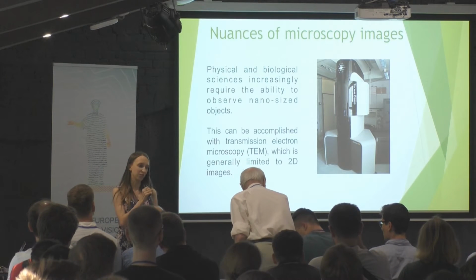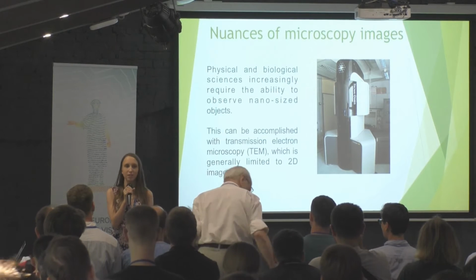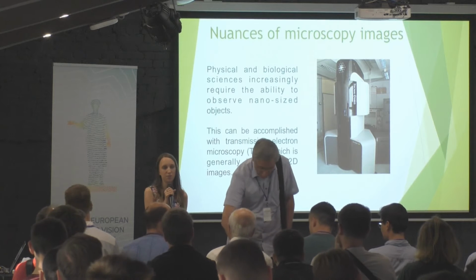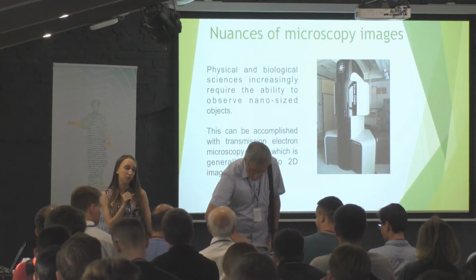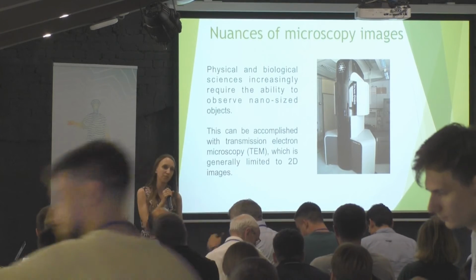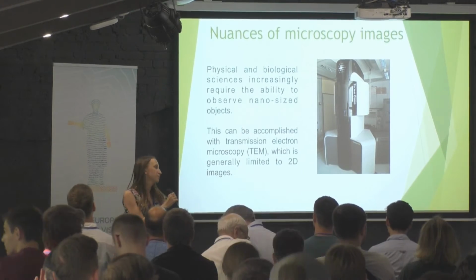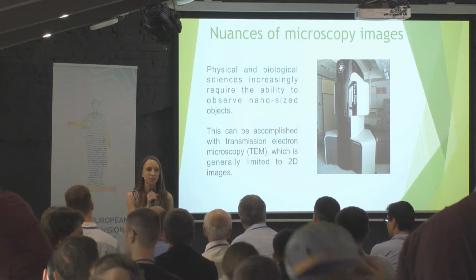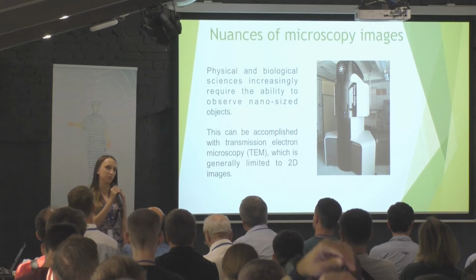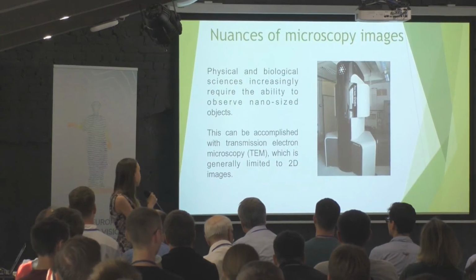So about microscopy. If you think about the world around you now and you look around, you'll see there are a lot of metals. And people from physics, they study the properties of these materials to make a better world, to make materials more robust to different changes, to temperature and things like this. And all this information about them actually lives inside the atomic structures of those materials. And it's really amazing that nowadays it's possible to see atomic structure with the help of transmission electron microscopy.